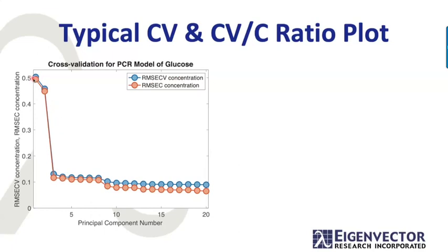Here we have a couple of factors in our model that start down in error. By the time we add the third one, we go to a fairly low error, and you can see as we add more factors, we get a little something that seems to happen about factor number 9. And these things do begin to get a little further apart.